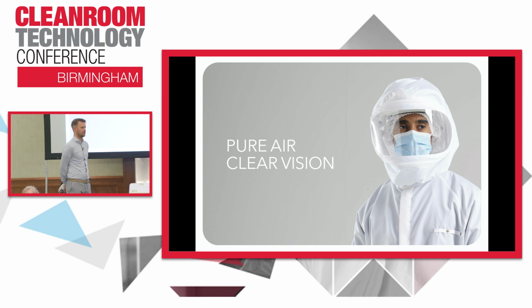The battery lifetime is 6,000 working hours, and the helmet actually, we do not know yet, because it's not yet in service. We expect that it will definitely last for 3 years, but we think it will last longer, because we can still do repairs. There are a couple of elements on here, like these poles, which will most likely break, and these can be easily repaired, so this will be supplied. But other than that, if there's a breakage on the electric part, I'm not sure if we can still fix that. So we haven't thought about the helmet part in a sustainable way, not to this point, because we simply do not have the experience yet.